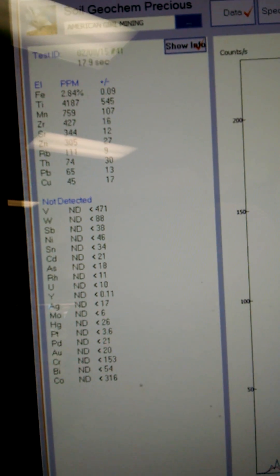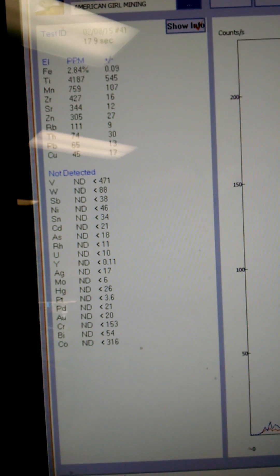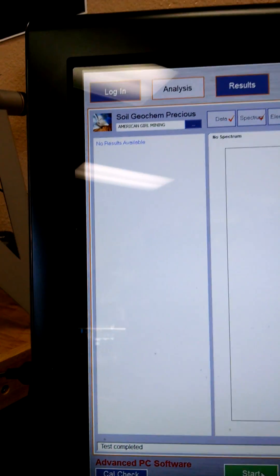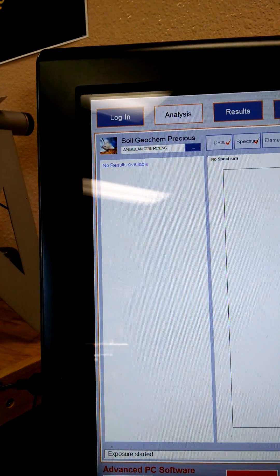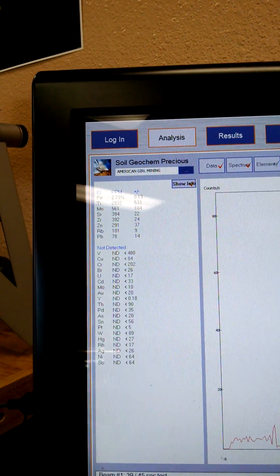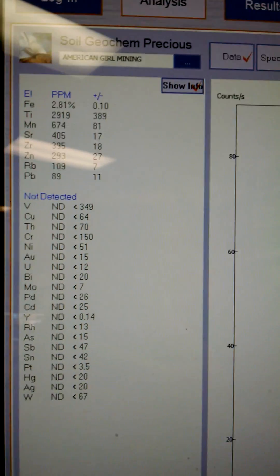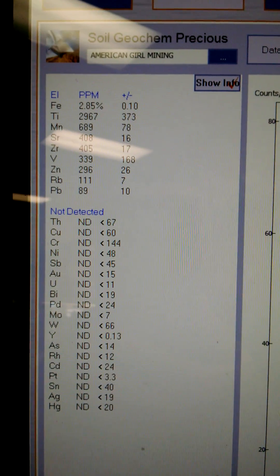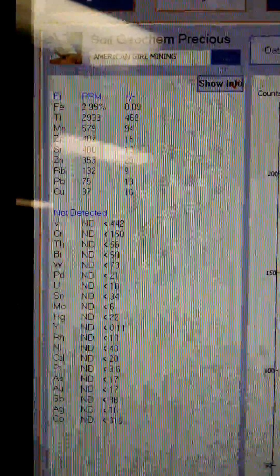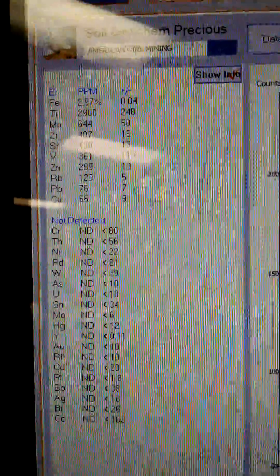That gives us our basic elements off the periodic table — things like iron, manganese, titanium, zirconium, all the different types of elements. So we're going to start the analysis now. The machine is set on two beams for 45 seconds. On the display: the left column shows the element, the next column shows PPM — parts per million — and then a plus/minus error factor. Below that is the 'not detected' section.